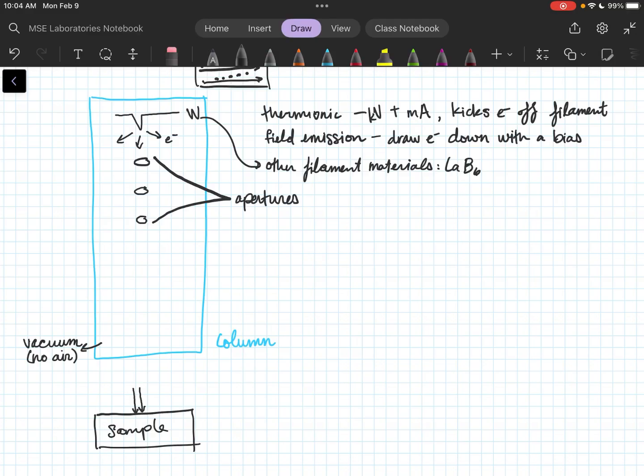Do you know the function of an aperture on a camera? It adjusts the amount of fuzz in the background. Interesting. Or it focuses on the thing that you want in the picture rather than something you don't want.